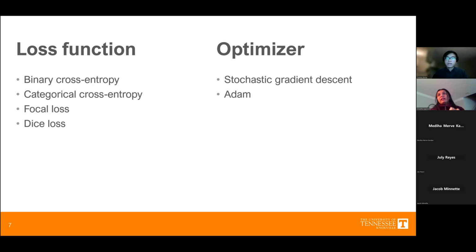So it provided a huge problem with my code when I tried to compare that. This is just an additional point, like for all imbalanced data, maybe categorical cross entropy looks very attractive from the literature, but when you really apply it, you would see that it makes more bubble predictions, and it predicts more false positives. Yeah.